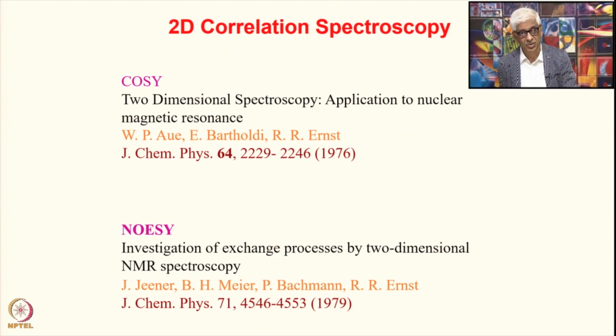And the basic developments were made by Richard Ernst. We see here R. Ernst first published in 1976 in Journal of Chemical Physics and then again in Journal of Chemical Physics 1979. Two fundamental experiments which have been crucial in all applications in structural biology. Okay. So, we prepared the ground to understand these experiments in the previous class, because all of these involve very crucial magnetization transfers, and that is the information carrier in these experiments.